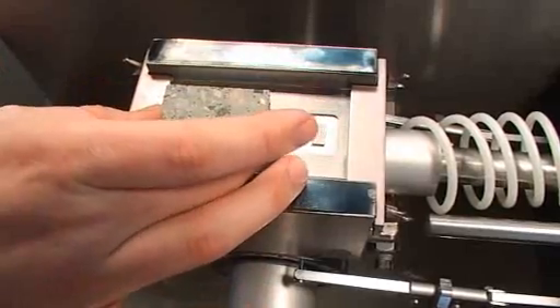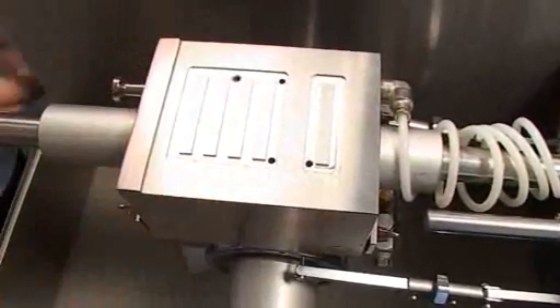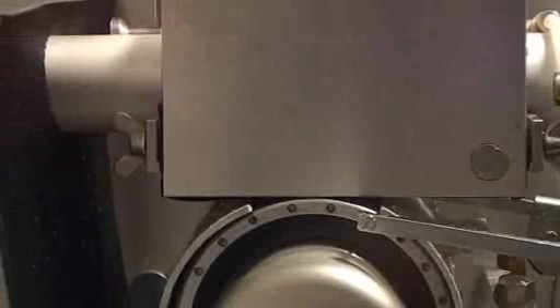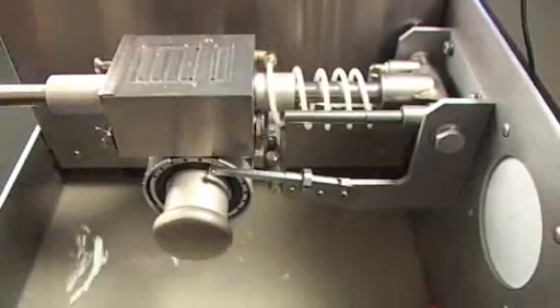When grinding the block, the block is attached to one side of the vacuum holder. Vacuum is applied and the vacuum holder is turned. The vacuum holder then carries the sample back and forth over the diamond roller where the grinding is taking place. The grinding stops automatically when the sides of the vacuum holder touch the ball bearings.